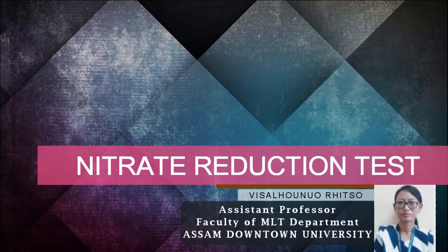Anaerobic metabolism requires an electron acceptor other than atmospheric oxygen. Many gram-negative bacteria use nitrate as the final electron acceptor. Bacterial species may be differentiated on the basis of the ability to reduce nitrate to nitrite or nitrogenous gases.